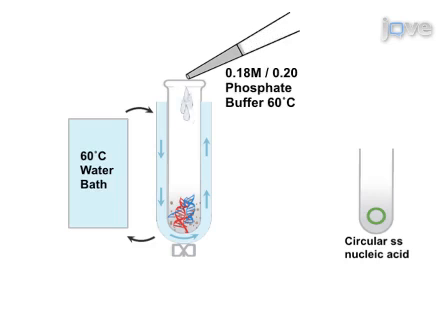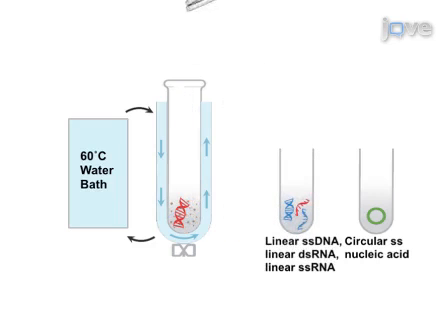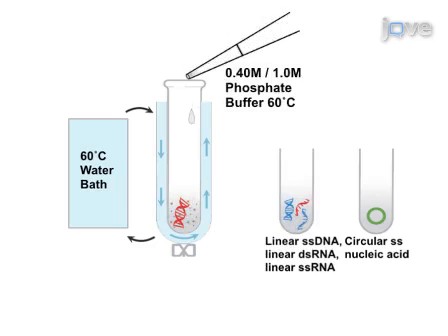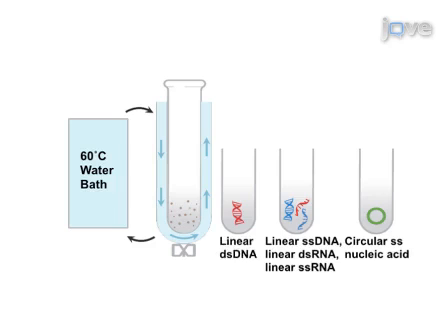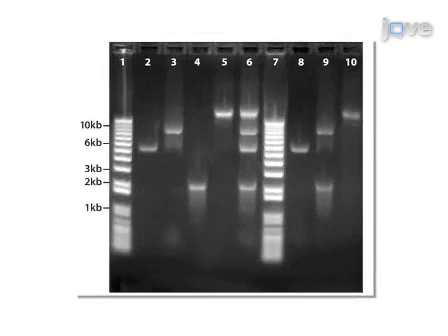Next, single-stranded DNA, RNA, and double-stranded DNA are sequentially eluted with different concentrations of phosphate buffer. The resulting nucleic acids are then desalted and concentrated in preparation for visualization, quantification, and identification by DNA sequencing.